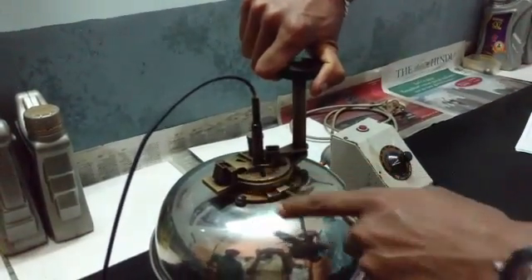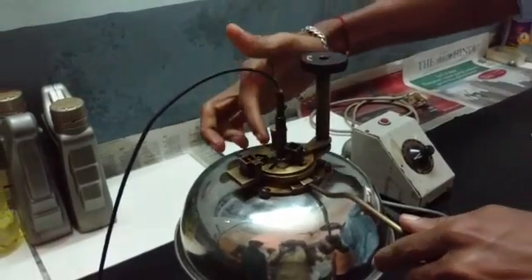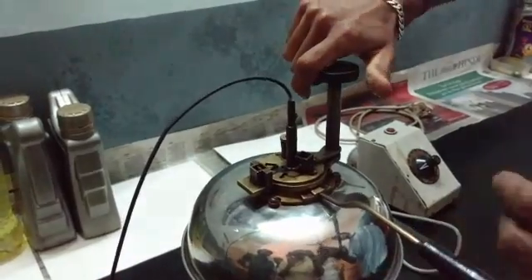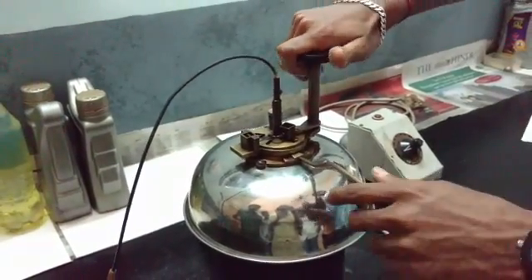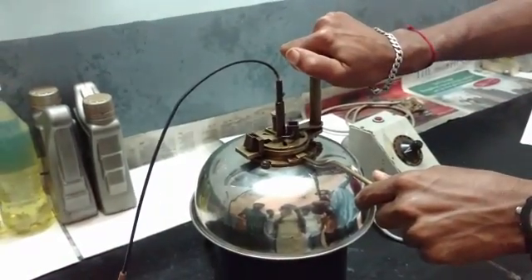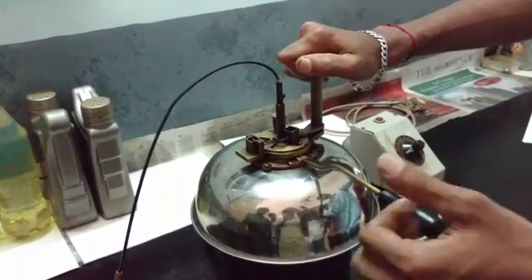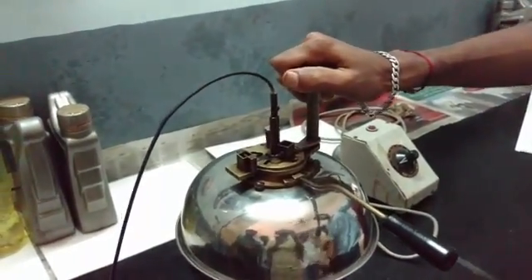You can see the mechanism is going to open and close. You're going to fire this lighter and check for the flash and fire point. At one point you'll get a flash — it's just a blink. At another point you'll get the fire point, where the flame will remain for at least five seconds or more.